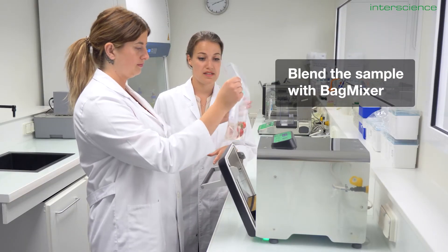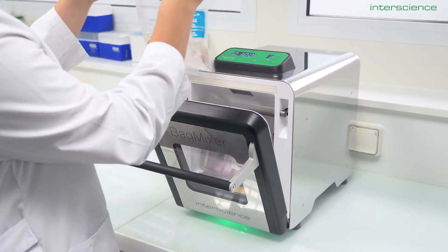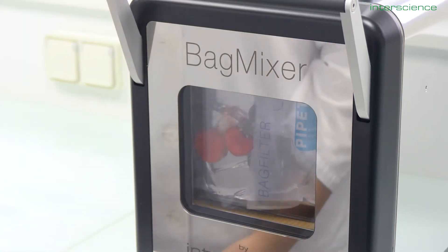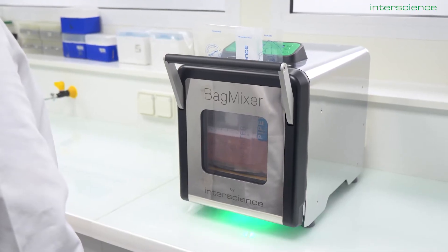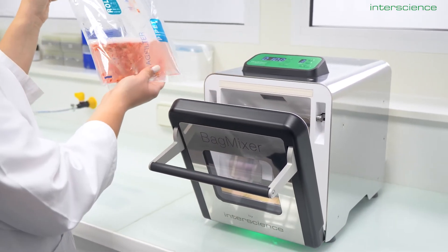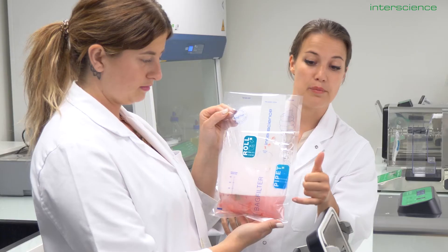The next step in the process is to homogenize the sample into a solution to extract the bacteria. We have different homogenizer sizes, from the minimix to the bag mixer to the jumbo mix. Here we have the bag mixer for the most common sample size, and it is equipped with a double brushless motor for your and your lab mate's auditory comfort. At the end of the process, a light indicates that everything went well. You can see the advantage of having a bag equipped with a filter: every solid particle will be stuck on one side of the filter, and you can pipette a clean liquid sample on the other side.